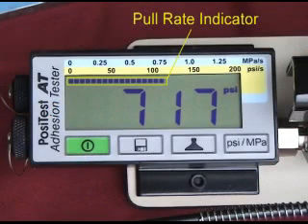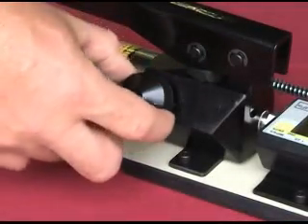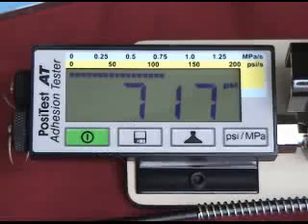The graphical pull rate indicator enables the operator to monitor and adjust the rate of pull. After the pull-off occurs, open the pressure relief valve. The display holds the maximum pull-off pressure value. Since calculations are made automatically by the tester, there is no need for conversion charts for different dolly sizes.